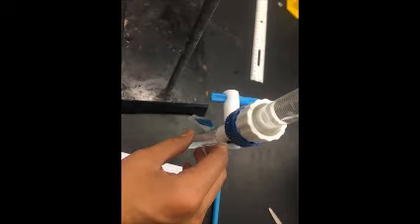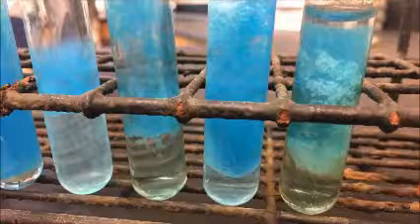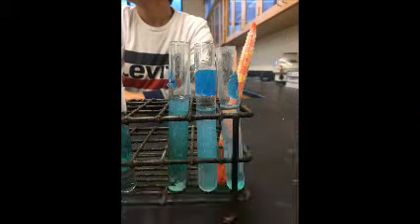After, we distributed an increasing amount of 1 milliliter of KOH into each test tube. Then we put enough water into each tube to reach a solution of 13 milliliters. We stirred the solutions and let them sit for 15 minutes. Lastly, we measured the height of the precipitate formed in milliliters.